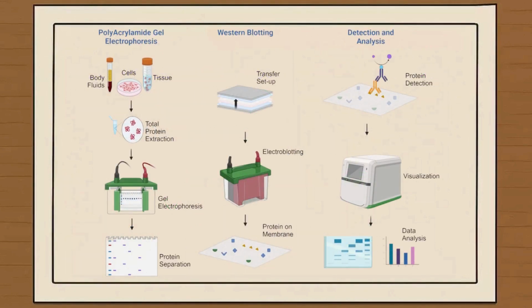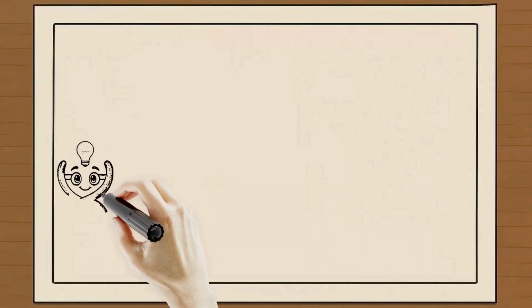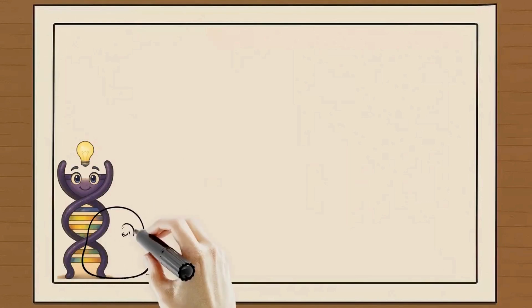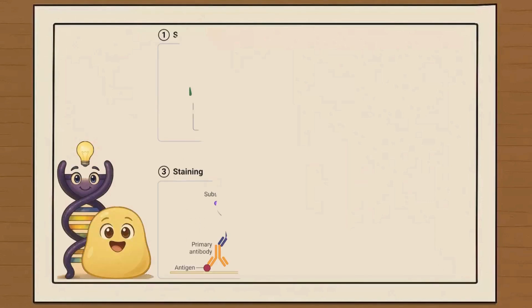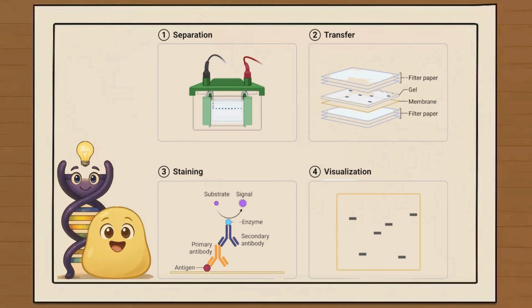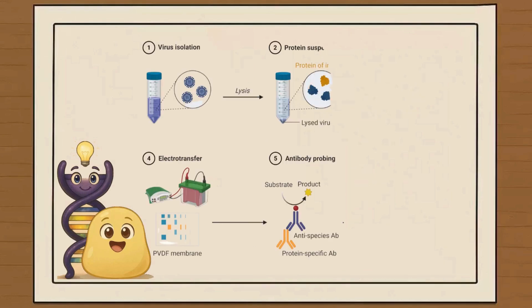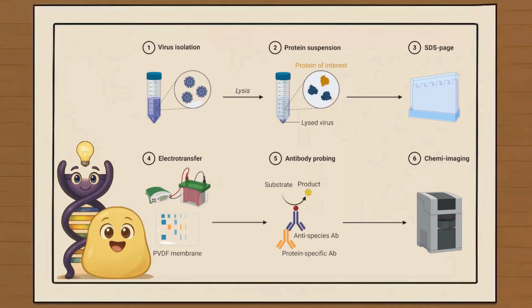These key improvements, from faster protocols to new detection methods, are making Western blotting more reproducible and quantitative than ever before. Wow! Western blotting is a core technique that continues to evolve, from its foundational principles to new, advanced methods that are pushing the boundaries of sensitivity and specificity. In 2025, it remains the most widely used blotting technique in research and clinical labs due to its versatility and ongoing technological improvements.